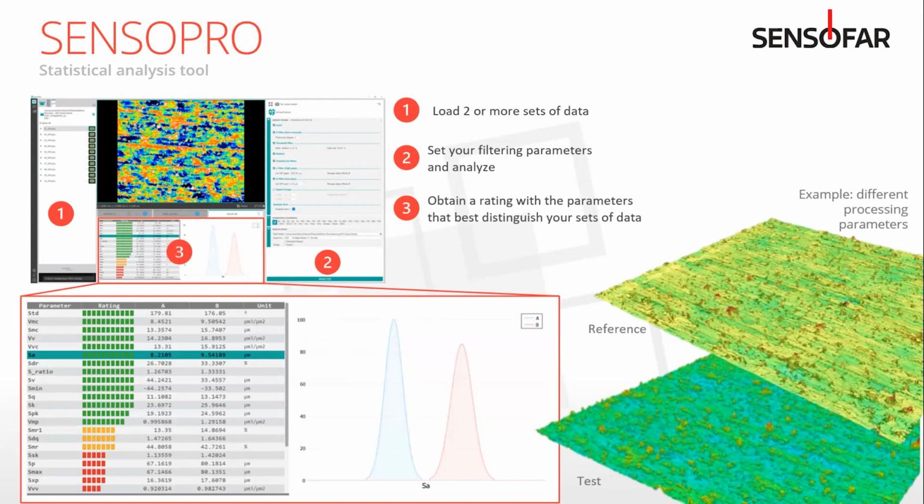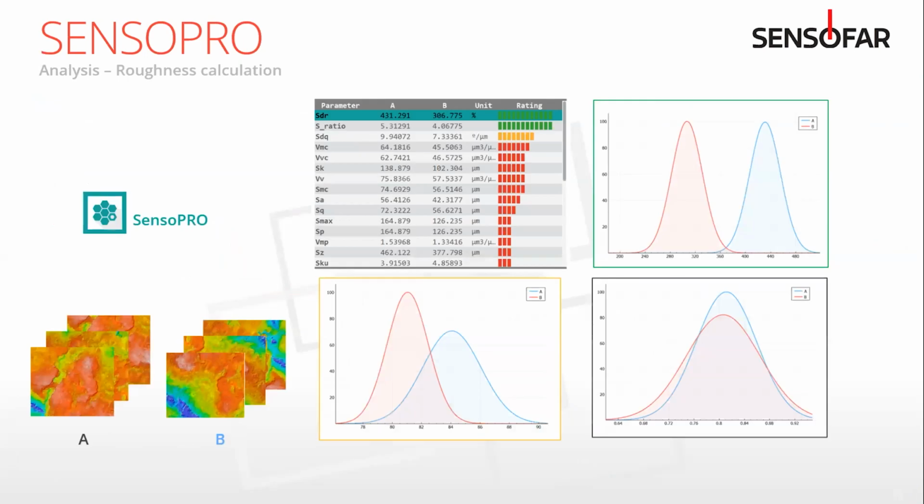And if you don't know what parameter differentiates your sample best, this rating is a good way to say, well, the surface roughness differentiates them pretty well, but the max peak height isn't a great metric, so we'll stop using that and instead switch to the surface roughness. Here's just another example of what that looks like visually.